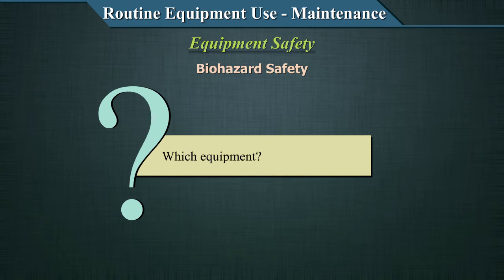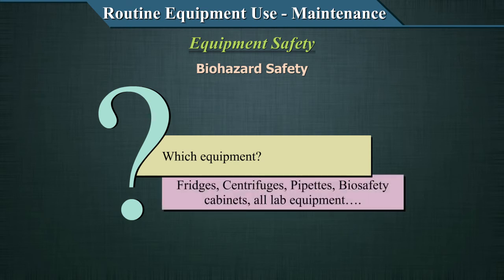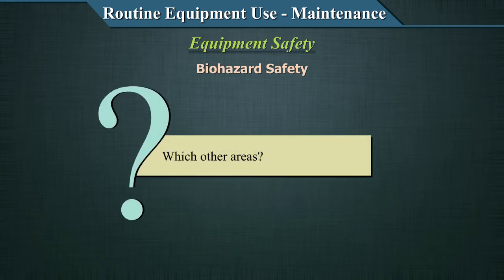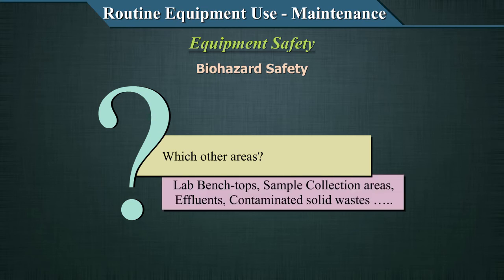Every piece of equipment requires decontamination — fridges, centrifuges, pipettes, biosafety cabinets, and all laboratory equipment. Apart from equipment, decontamination also involves lab benchtops, sample collection areas, effluents, and contaminated solid waste. Decontamination practices should be part of your overall laboratory safety protocol, not just for equipment but also for all other areas.